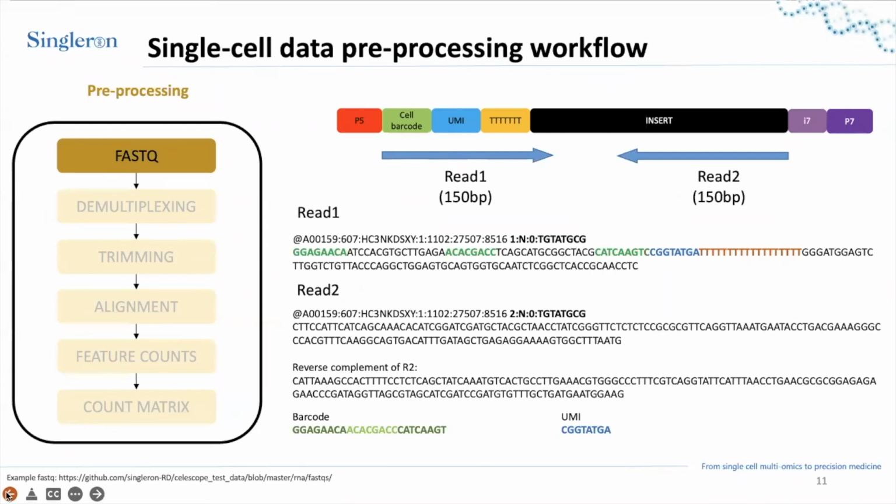Part of it is that it needs to look at different algorithms or different parameter settings to change the mapping by the edit distances for both the UMIs as well as the barcode.